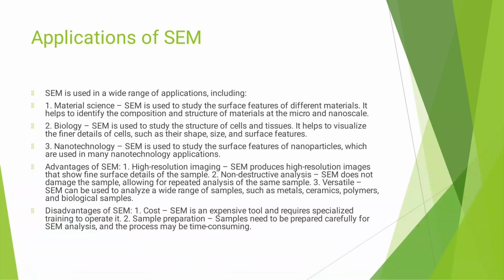The disadvantages include that it is very expensive, and the sample needs to be prepared carefully for some analysis, and this process may be time consuming.